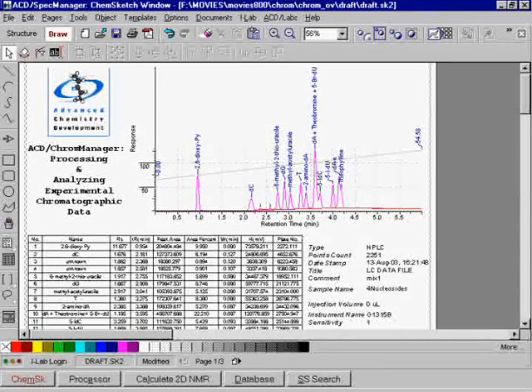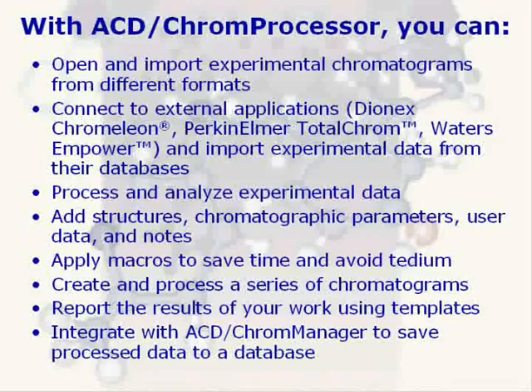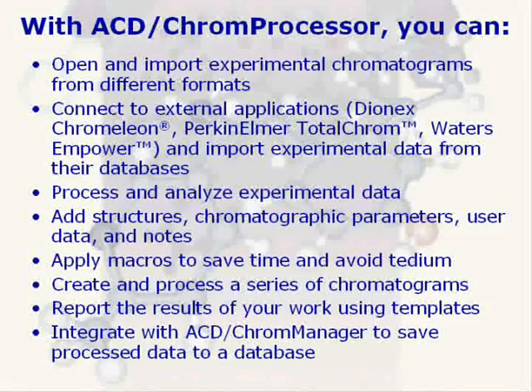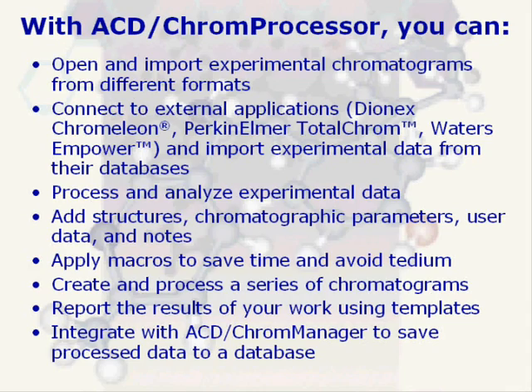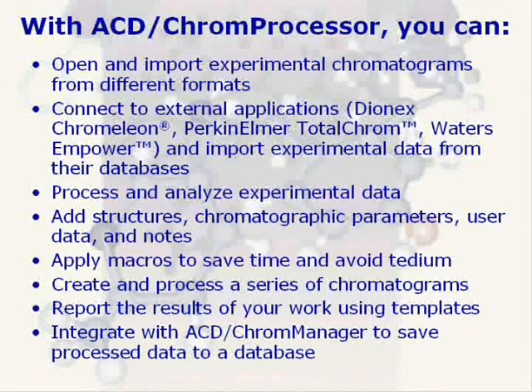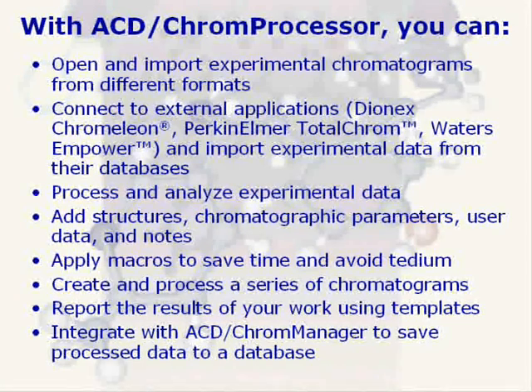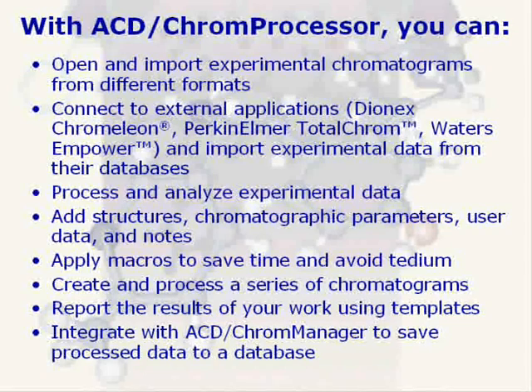With ACD Chrome Processor, you can open and import experimental chromatograms from different formats. Connect to external applications like Dionex Chromelion, PerkinElmer TotalChrom, and Waters Empower, and import experimental data from their databases.